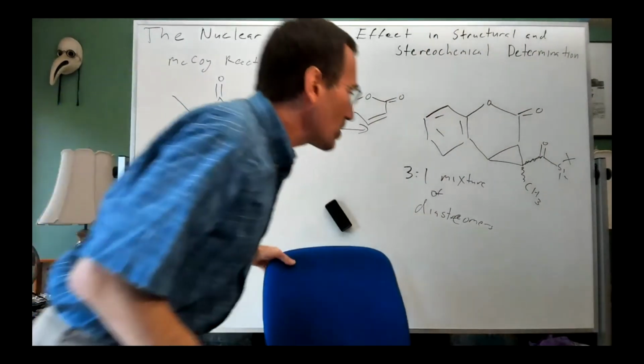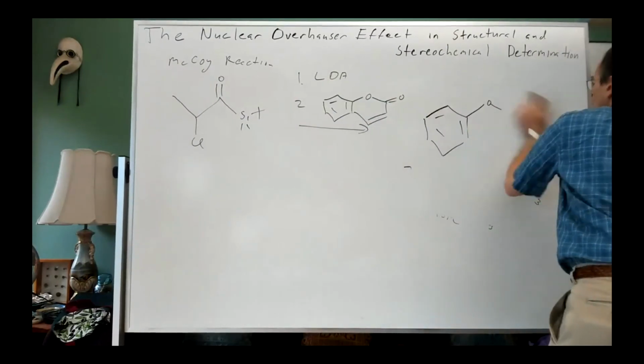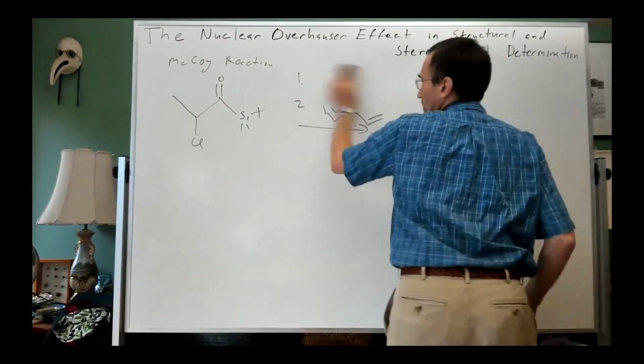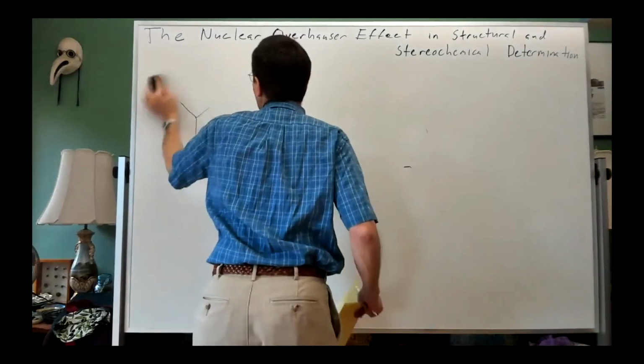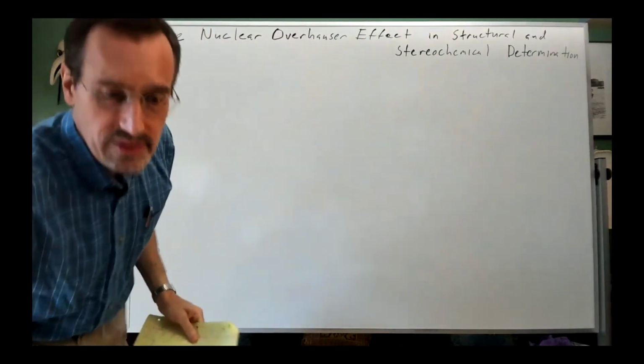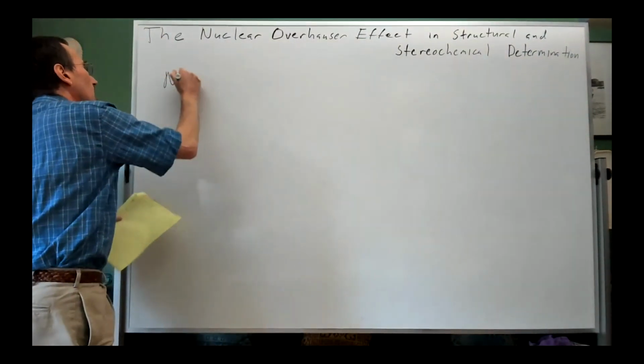All right, I want to show you a couple of last points, and I want to take you to a NOESY spectrum as well, just so you've at least seen it once, and then you'll get more of them in the homework.